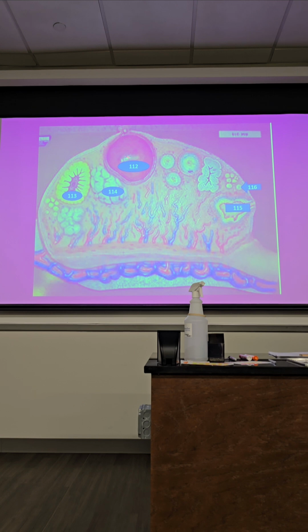This one is after the mature Graafian follicle releases the egg. Okay? I wouldn't expect you to know that.